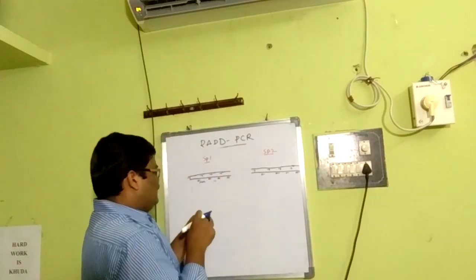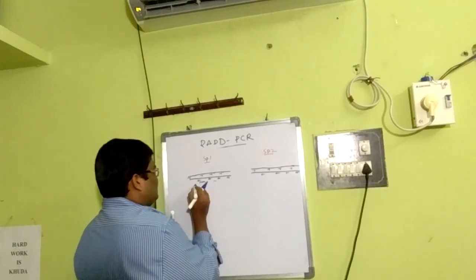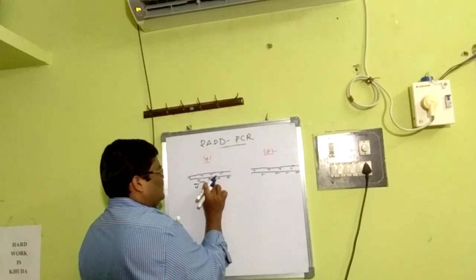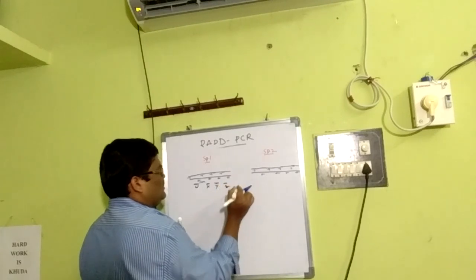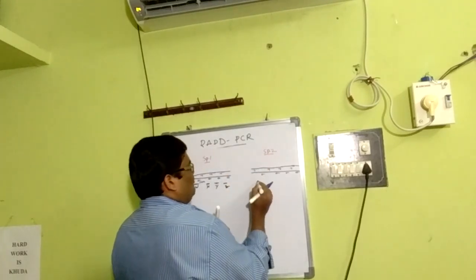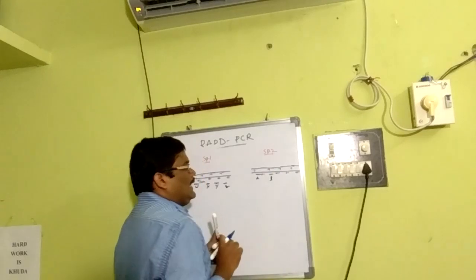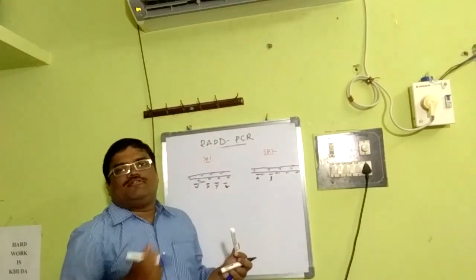Then one DNA fragment will get it. Say for instance, this is a DNA fragment W, this is a DNA fragment X, this is a DNA fragment Y, and this is the DNA fragment Z of species 1. Say the same case here also. We will get a DNA fragment A, DNA fragment B, but here, when the primer anneals, it leads to amplification. We all knew that.